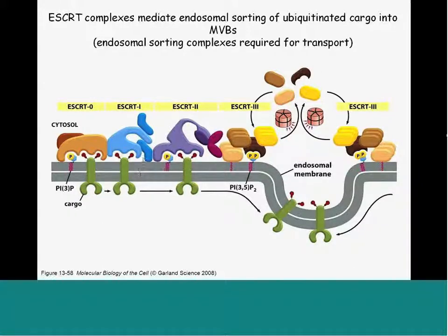And since research in my lab is on understanding how proteins are downregulated by lysosomes or targeted to lysosomal degradation, we're very much interested in identifying novel ubiquitin binding domains that might play a role in this process, in addition to the ones that have already been discovered.